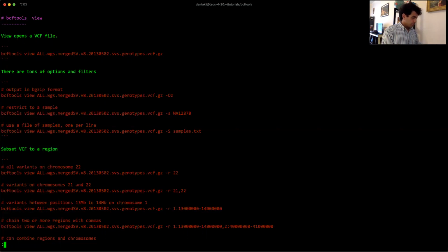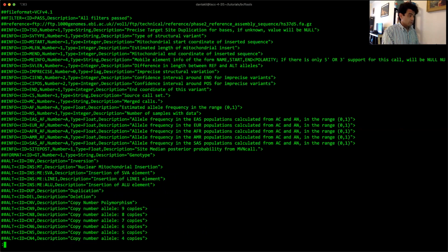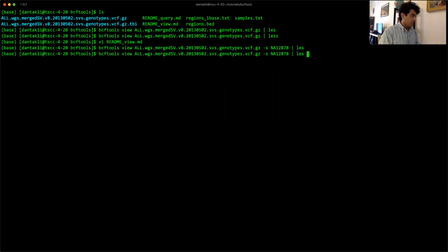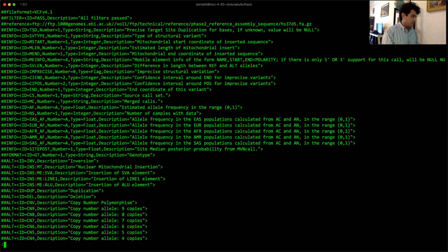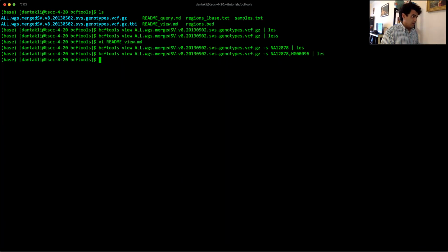Now you'll notice that instead of having those 2,000 samples, we just have one sample, and that's really useful. You can also chain together more than one sample, and now you can see there's 2 in there, right?